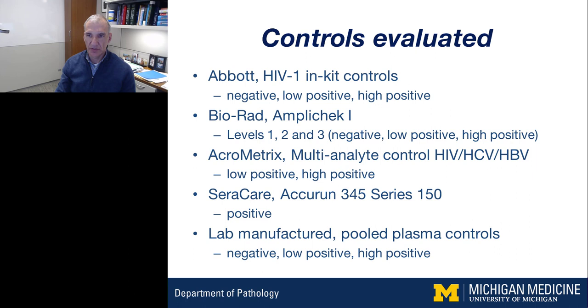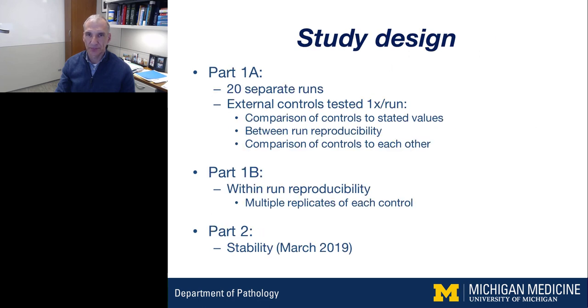Sericare, positive control. And then we also used a lab manufactured by us control that was generated by pooling plasma from a variety of patient specimens that included negative, low, and high positives. So all of these were used in the evaluations that I'm going to describe forthcoming.